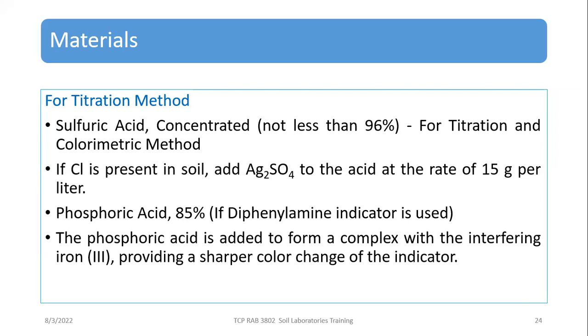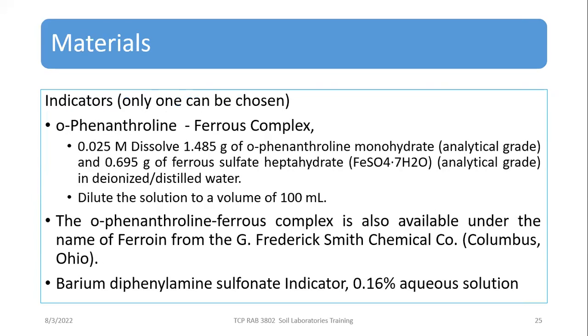The phosphoric acid is added to form a complex with interfering ions and provide a sharper color change of the indicator.